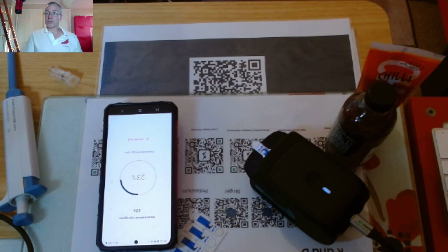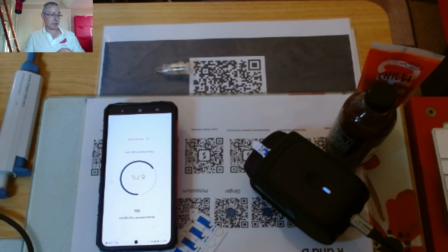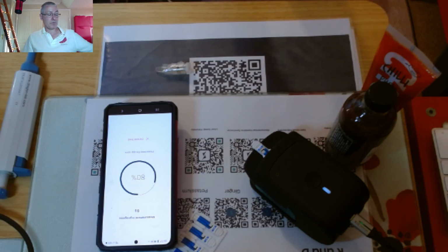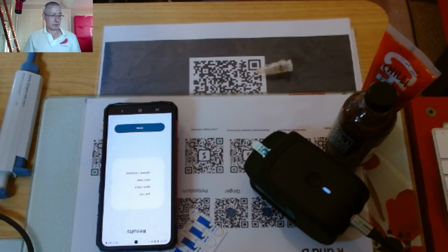Now, obviously in less than 30 seconds, the data's actually going to go to the cloud, at which point I'm going to show you how to share that data either with your colleagues or with Zimmer and Peacock, because I think part of the product offering from Zimmer and Peacock is both the technology, but of course also the long experience that we've had doing this kind of thing.